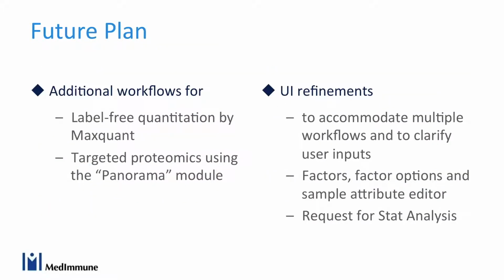And we're still doing phase 2 with LabKey, which involves being able to look at label-free quantitation and possibly other data types. We also want to optimize the import UI, because the first version we did was quite cumbersome, and we are in the process of optimizing that. Certainly, we're going to implement the Panorama modules because we're ramping up those kinds of activities. So we will continue to work and enhance the system for our own needs.